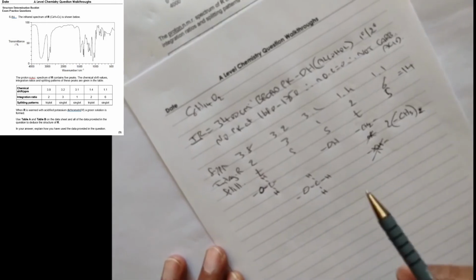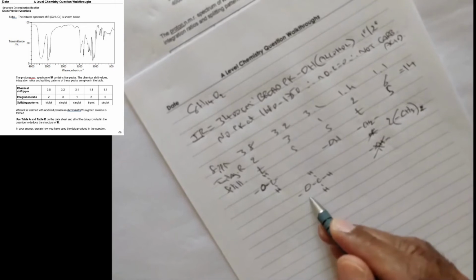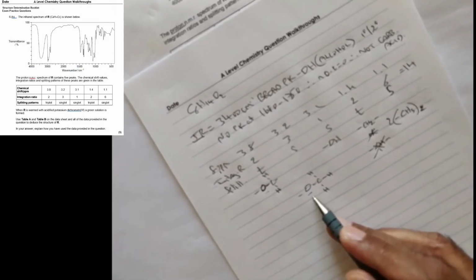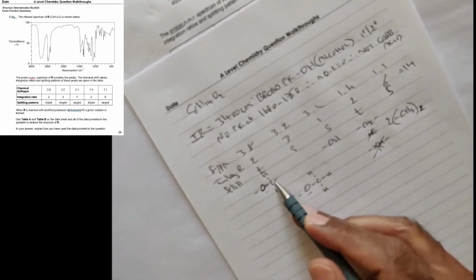So now that I've got these fragments, we come to the relatively easy part, because now we need to join all of these fragments like a jigsaw to see how they fit. First thing I think about is, hold on, I've got 1, 2, 3 oxygens, but in my molecule there are only 2 oxygens. So 2 of these oxygens are the same ones showing from different aspects. Immediately I'm thinking this one and this one is probably the same. Obviously that OH, it could be that hydrogen's bonded here, but then that would be the end of the molecule. What else are you going to join afterwards? So it could be that this and this is the same. It's just that this is being shown from this end, and this is probably being bonded from that end.